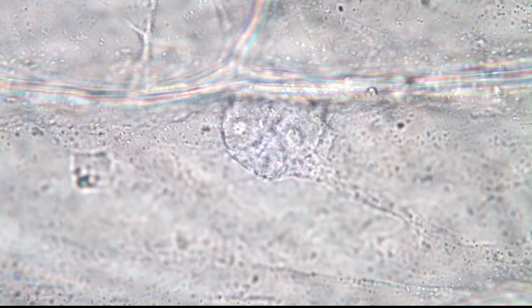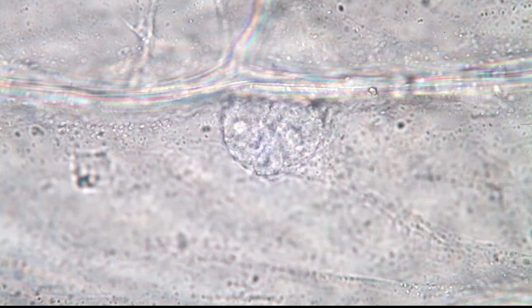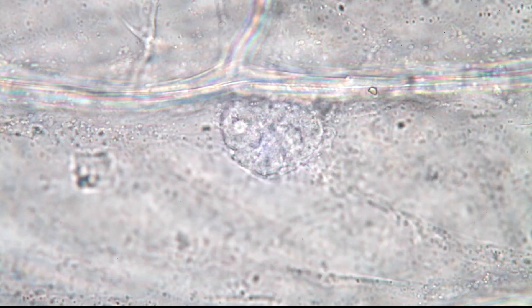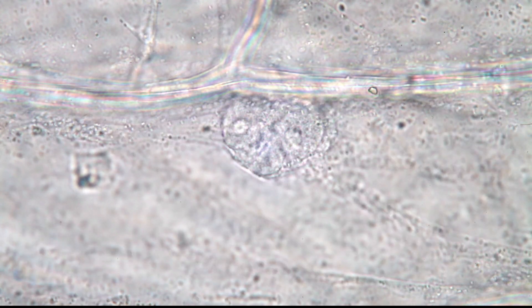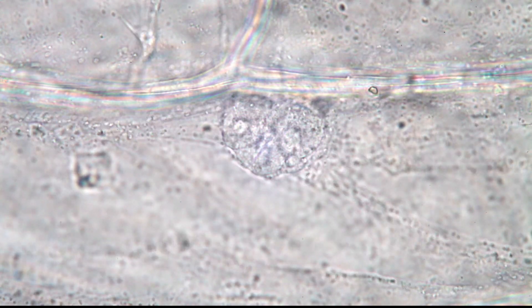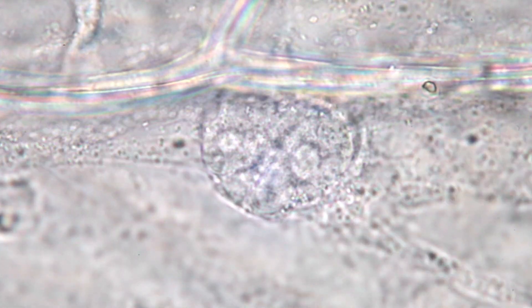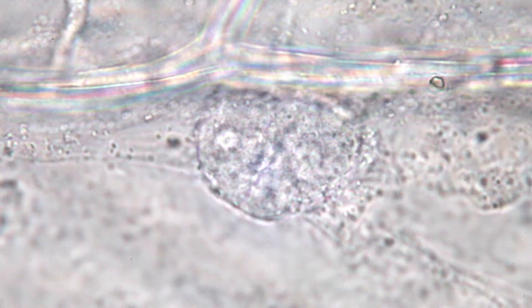At a higher magnification those dots have a directional movement — they're not just wiggling around but actually streaming, and they seem to be vesicles. In the time-lapse you can see these small cell organelles appear to be vesicles carrying substances around, moving inside the cell. At 20 times the original speed you can see there are almost like little highways inside the cell along which these cell organelles move. These vesicles are being pulled along a protein network inside the cell called the cytoskeleton — small protein fibers, not even visible microscopically.